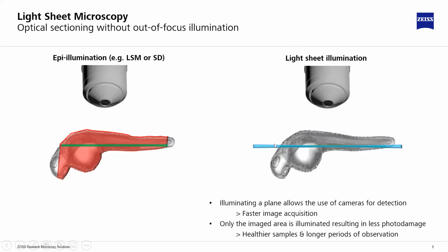And this highlights two major advantages of light sheet microscopy. One, they're fast, in part because we can use cameras for detection rather than point detectors. And two, light sheets are gentle, with substantial reduction in laser exposure, especially for samples that require hundreds or sometimes thousands of Z-planes to capture the entire volume. If you have a large structure, you want something that goes fast and is gentle so you don't bleach your signal as you're acquiring your data.